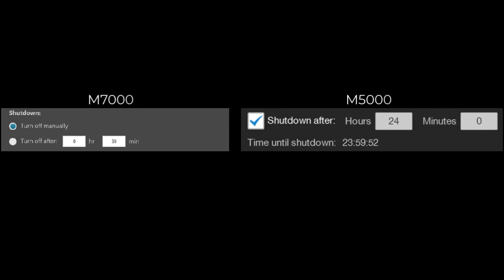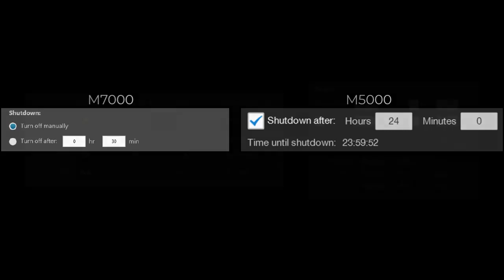A shutdown option can also be defined at this time. The default selection is to manually shut down the incubator by deselecting enable or use incubator.